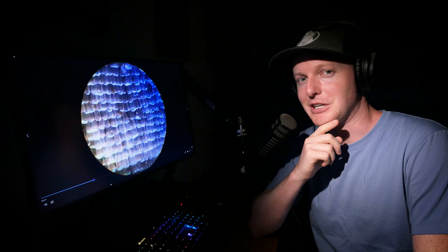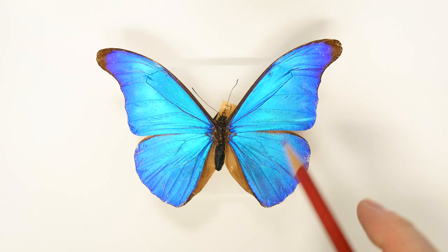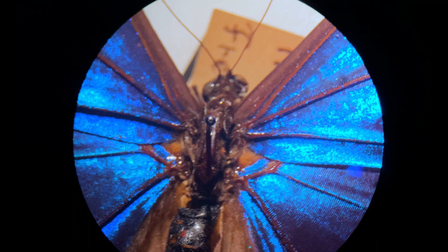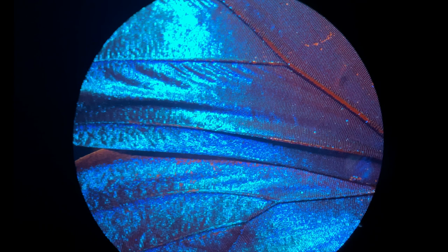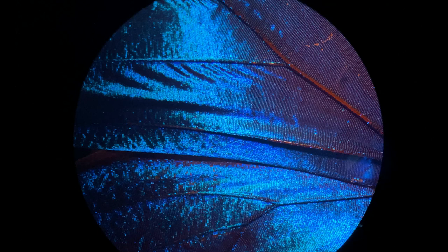Here's the other blue morpho. It's much much shinier. So I wonder if these scales look any different. Nice view at the center of the butterfly. You can kind of tell already. We'll get a better view when we look at that wing. Yeah it almost looks like that fabric that has all those sequins on it. You know that reflects light. This looks cool. I was moving the light around. You can see how it shimmers.